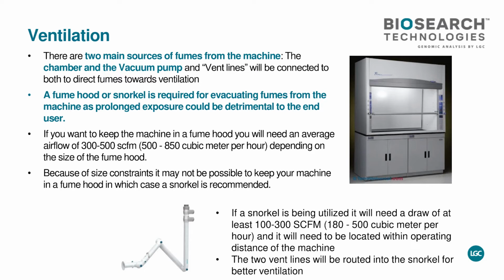Okay, you have the synthesizer. It's very important to have ventilation. So use a fume hood or a snorkel. This is not really for the synthesis. The synthesis will work well even if you don't have a fume hood. It's more for your technician. You also have the different reagents. But for the technician, it's very important to have this fume hood. You can also have a working hood or things like that. And I give some average airflow for this, 500 to 850 cubic meters per hour. And for the snorkel, it's 180 to 500 cubic meters per hour.